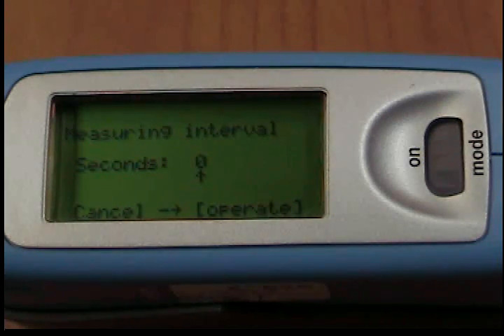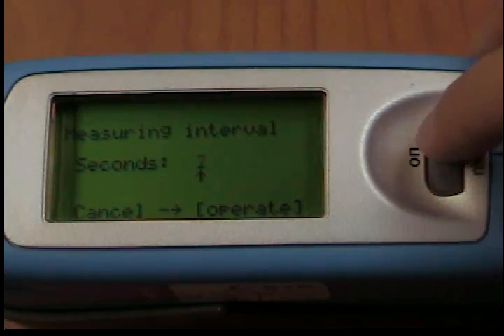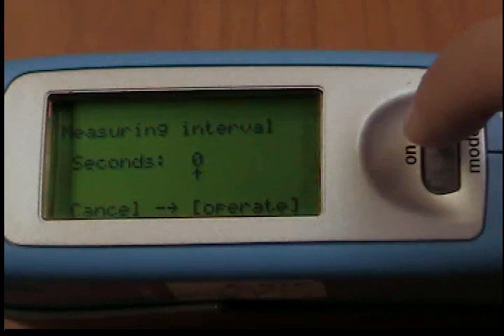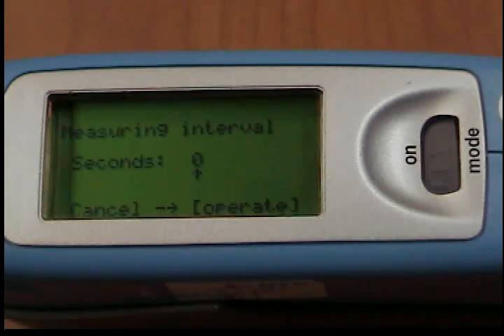If you select this function, you will first be asked to enter the time that defines the interval. The longest measurement interval possible is 9 seconds. A setting of 0 seconds indicates the shortest interval possible, one that is identical to the duration of the measurement, which is about 0.5 seconds per geometry.